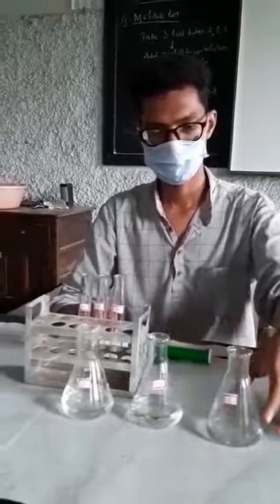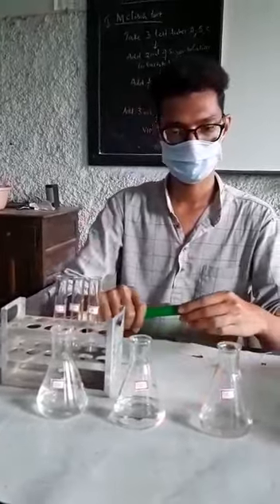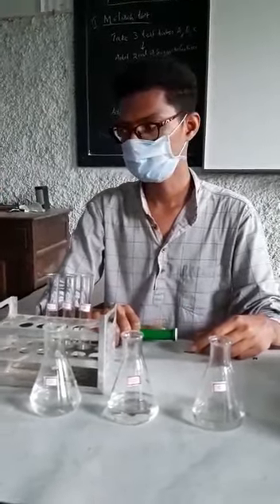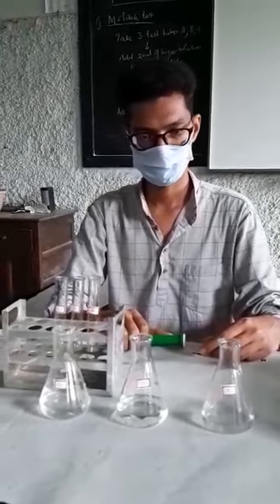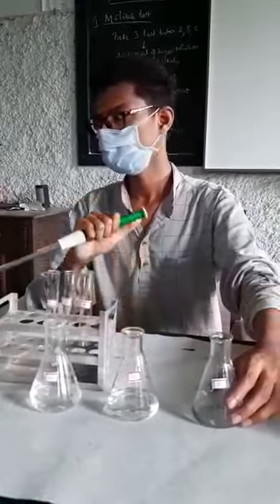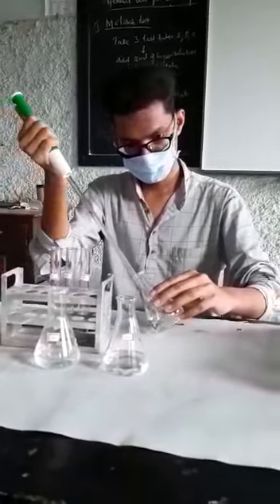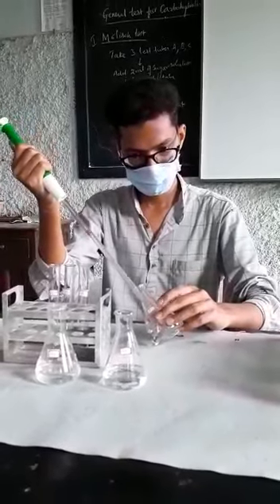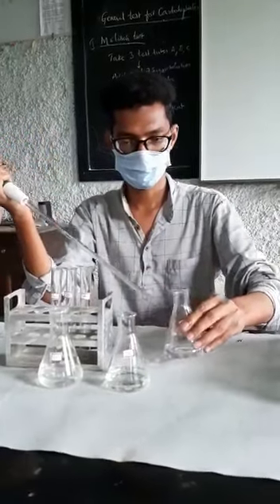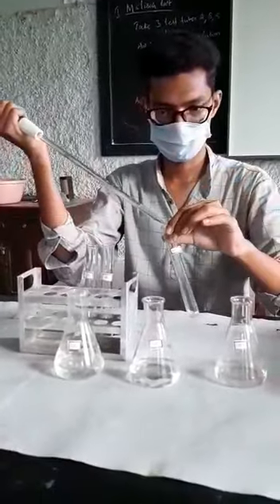And he has also kept 3 conical flasks with 3 different samples, and those samples he has labeled as A, B, C. Now he will pipette out 2 ml of each solution and add it into the corresponding test tubes. Okay, now you can add sample. You are adding sample C. Yeah, first he is taking the sample C and adding it in tube C.